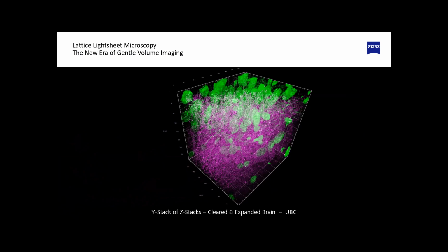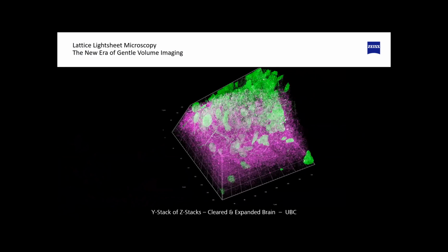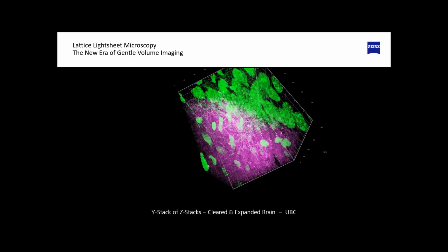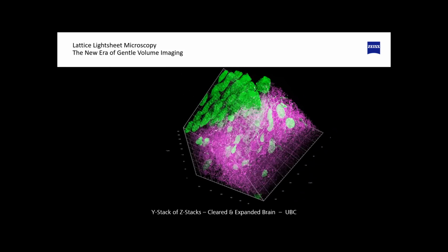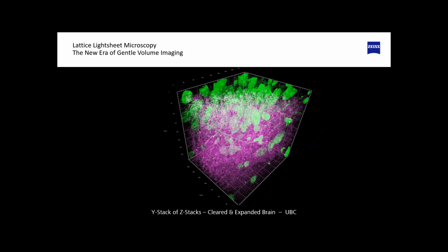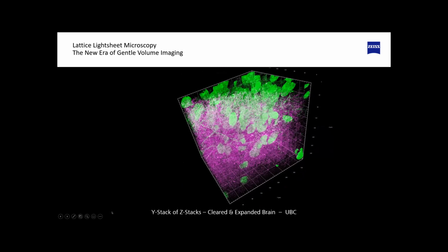Having talked about hijacking before between live-cell imaging, developmental biology, and deep tissue imaging and neuroscience, I'm going to show you this because this is an imaging stack through, and I have to look this back up, I think 100 something micrometers, also taken with the same microscope, the lattice light sheet. And this is a sample that was prepared by Anne-Marie Craig's lab and was sent to our demo labs in California.